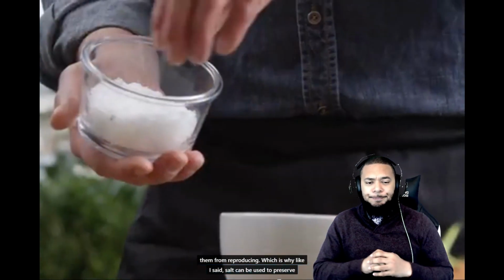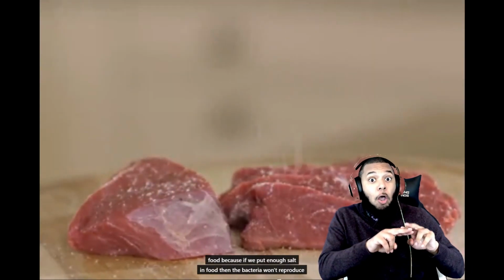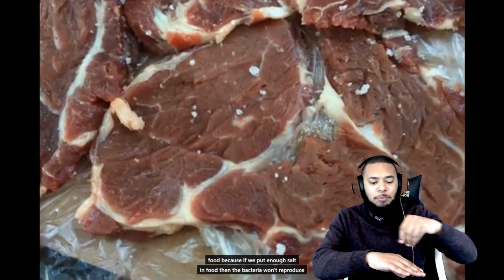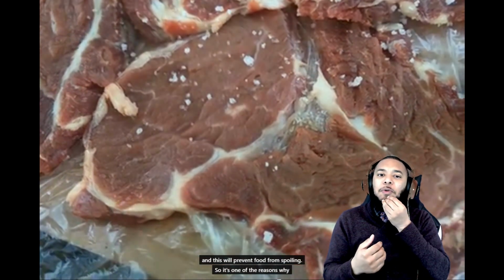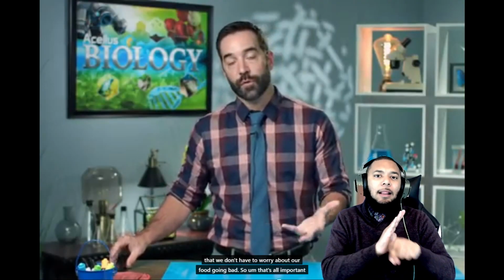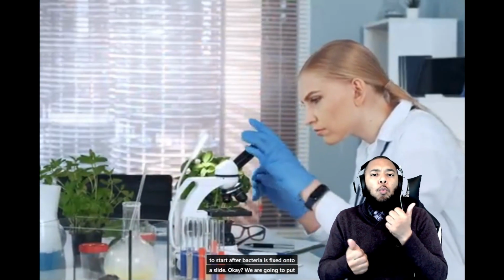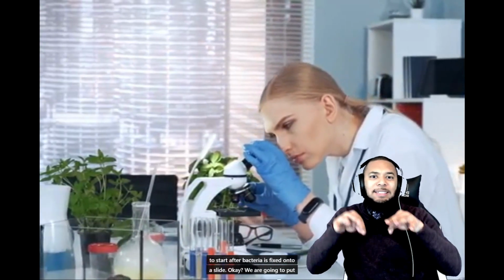Severe water loss inhibits them from reproducing, which is why, like I said, salt can be used to preserve food. If we put enough salt in food, then the bacteria won't reproduce, and this will prevent food from spoiling. It's one of the reasons why we use salt, because it basically damages the bacterium and kills them so that we don't have to worry about our food going bad. That's all important because we're going to use that principle of the hypertonic environment to help us through this gram staining procedure.